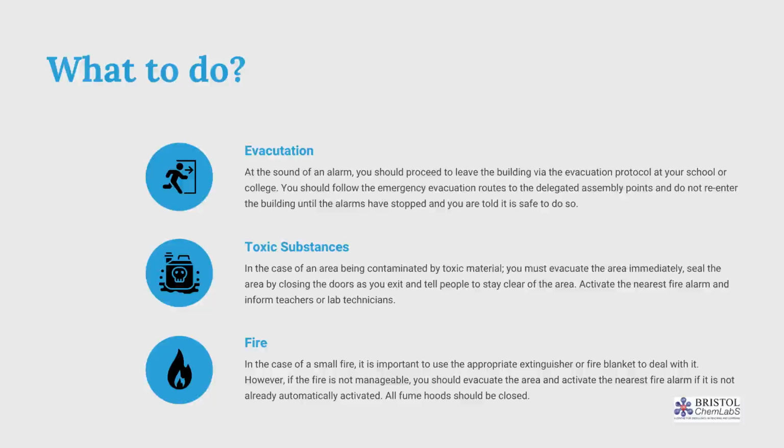In the case of an area being contaminated by a toxic material, you must evacuate the area immediately. Seal the area by closing the doors as you exit and tell people to stay clear of the area. Activate the nearest fire alarms and inform teachers or lab technicians.